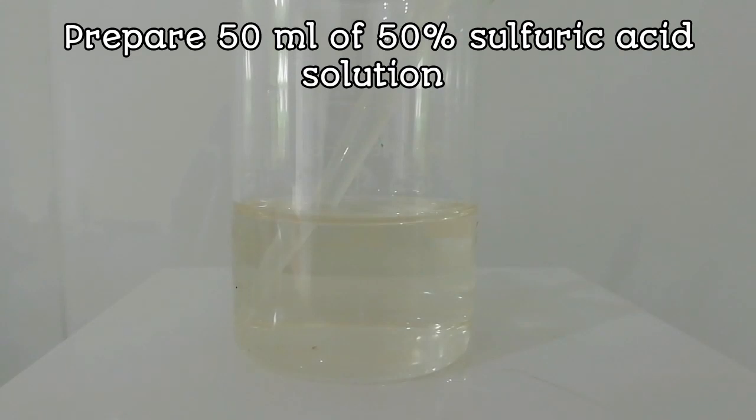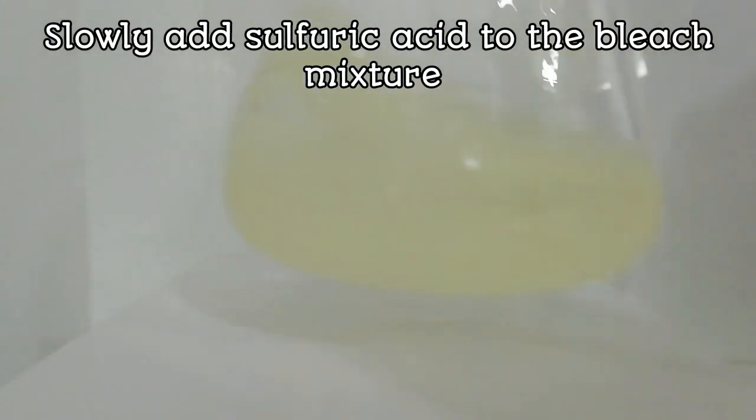The next step is to precipitate out our product. For that, 50 ml of 50% sulfuric acid is added slowly. In this case, first acid reacts with hydroxide and carbonate in the solution. Then, hydrazine sulfate starts to precipitate out.